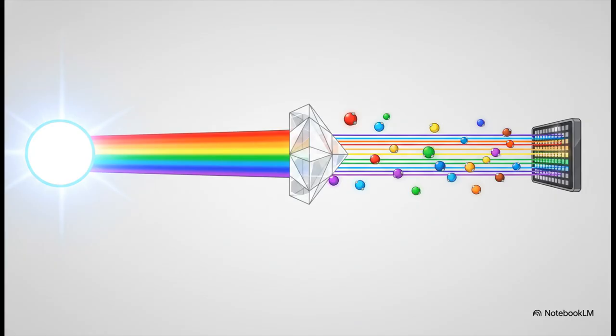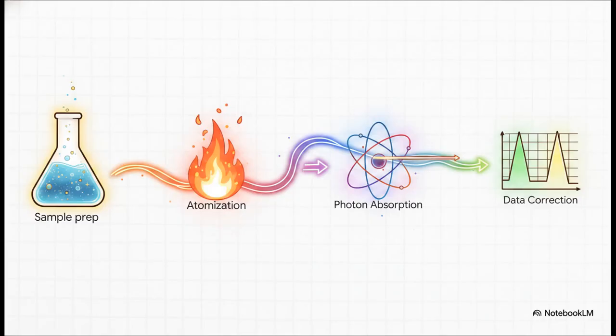This completely neutralizes that annoying single-element limitation of traditional AAS. It brings the technique firmly into the era of true multi-element, high-throughput analysis, and, get this, it even allows for molecular speciation. All right, let's lock this in.